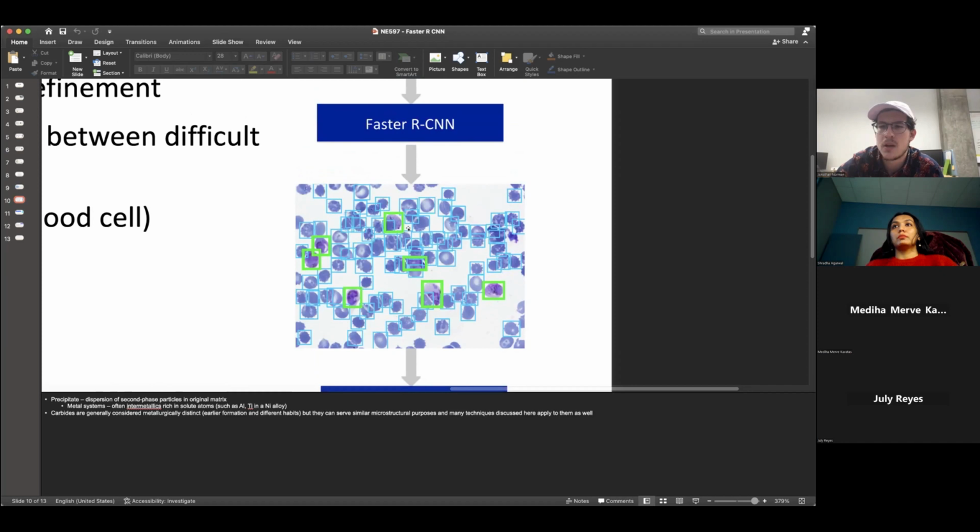It doesn't necessarily learn from successful iterations. I believe it breaks the image down into about 2,000 different possible bounding boxes, and then it does... Based on what? There has to be some criteria it is taking. Is it because it sees a different edge, a different color intensity?